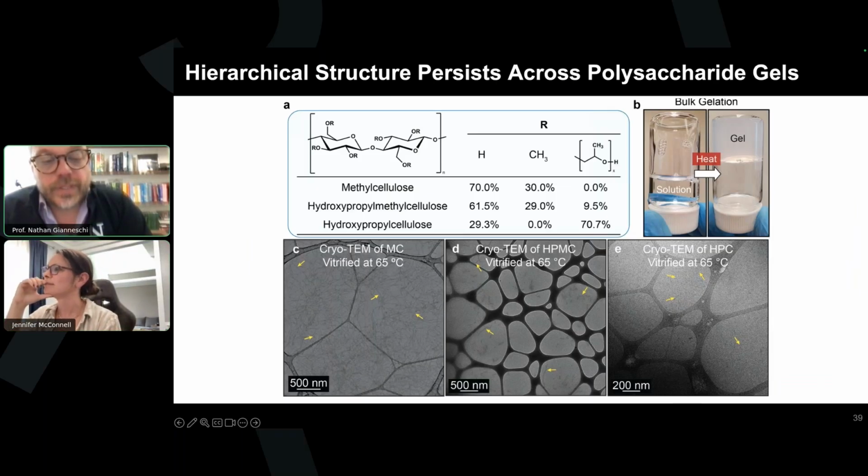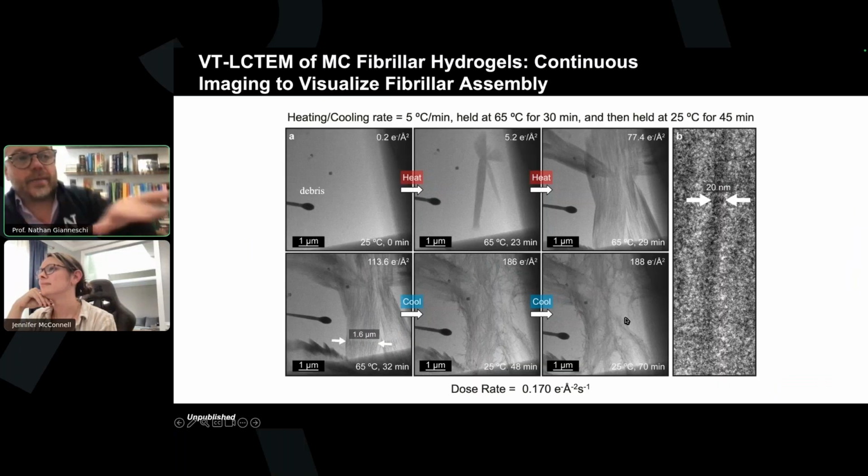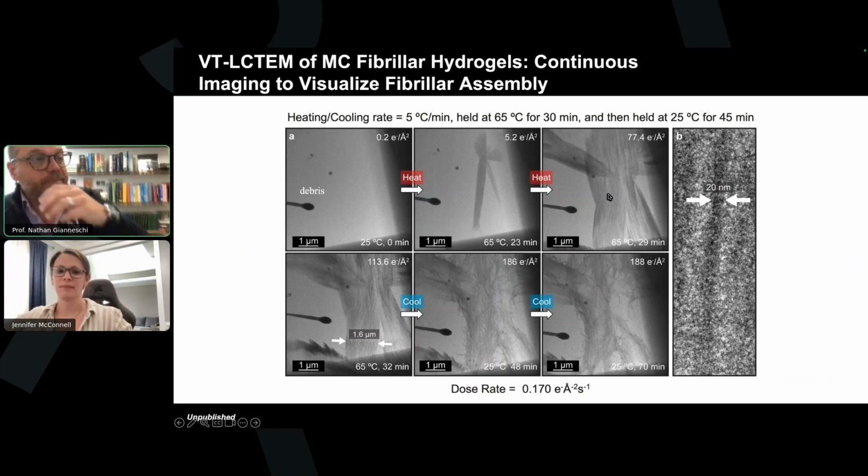Yeah, so the way those experiments are done that I didn't talk through, I'll go here just so you can see. I was hedging a bit. We don't believe that this is damage. In other words, we can heat the cell without imaging at all, right? And then just open up the beam and get these kinds of images that you see on the top right.